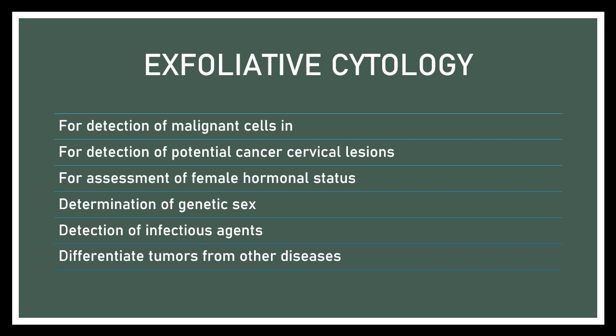And then, of course, the detection of infectious agents. In your exfoliative cytology, you are not only dealing with the shed, desquamated cells, but you will also check on the different microorganisms present, such as the presence of fungi in your smear and the presence of bacteria.